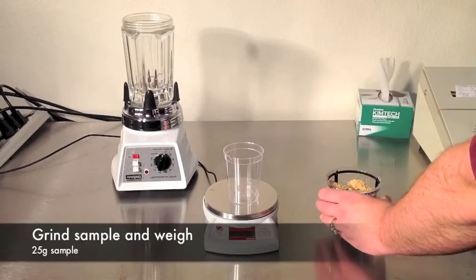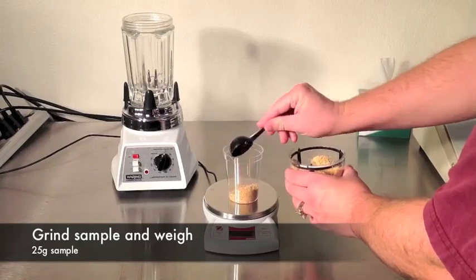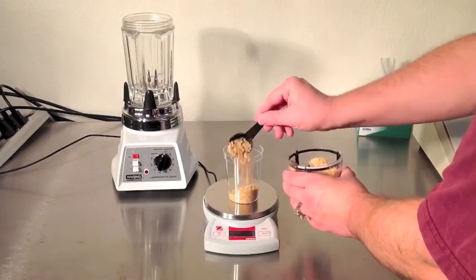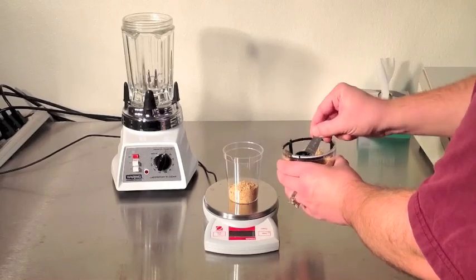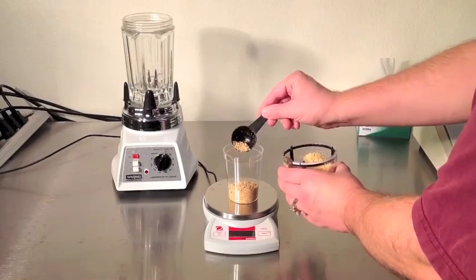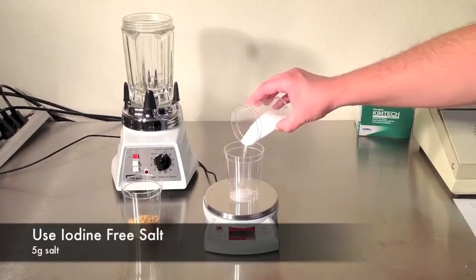First, grind your sample. A slightly coarse grind like you'd use in a drip coffee maker is appropriate. Measure 25 grams. Next, measure 5 grams of iodine-free salt.